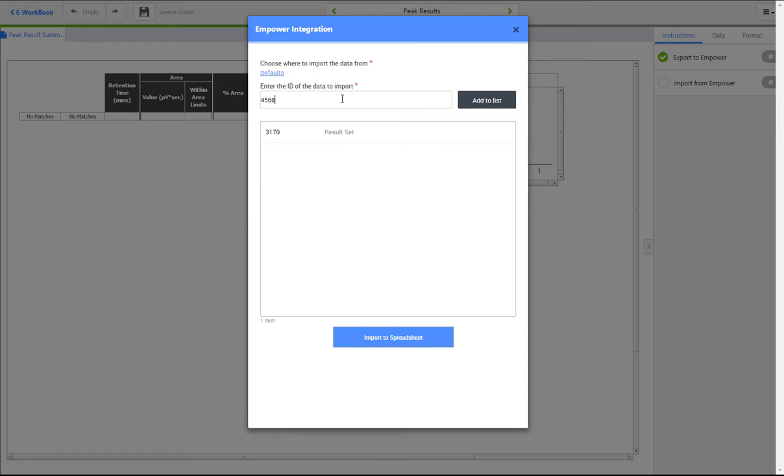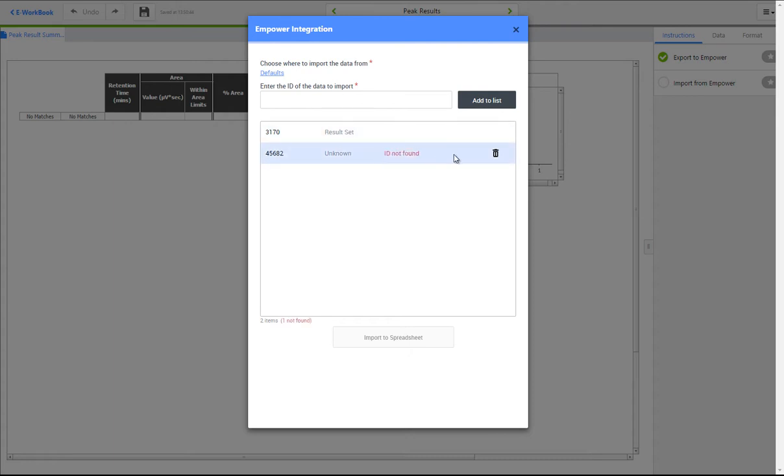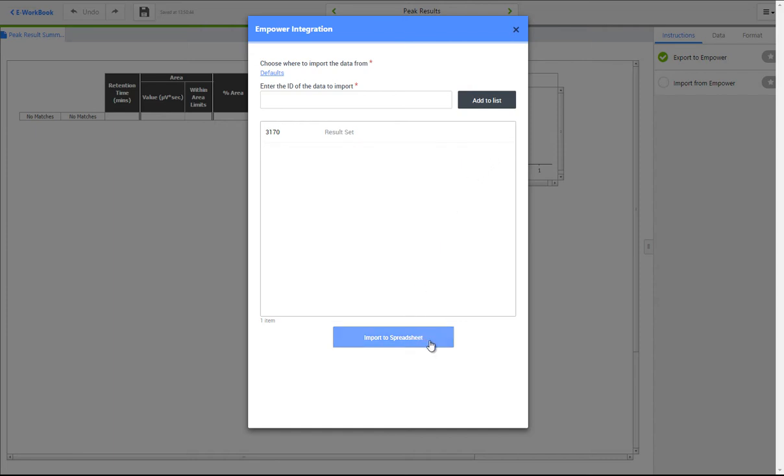The IDs are verified in mPower to ensure the data exists. Any invalid IDs are flagged to the user and can be removed from the list. Only results with valid IDs can be imported.